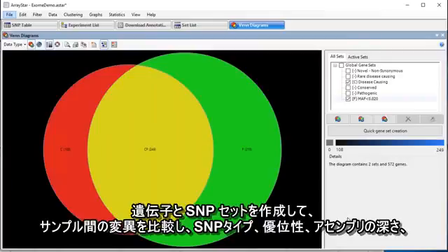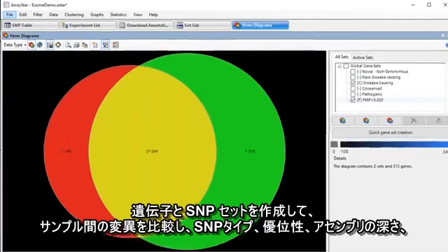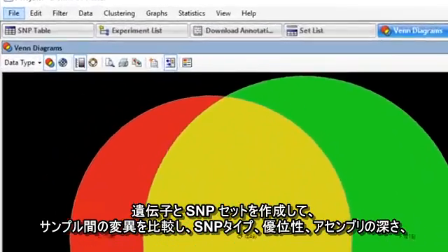Create gene and SNP sets to compare variants between samples and to locate important variants.